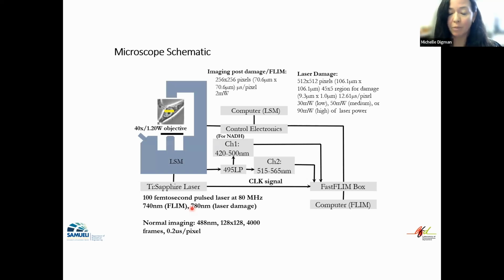And that's really what we're measuring, the excited state of those electrons. But of course, we can only detect it when the photon comes back and hits our photocathode, and we know exactly the time that occurs. So we need to synchronize this to our laser using some sort of card, a FLIM card.